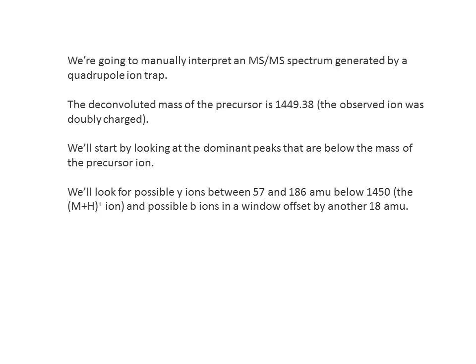This spectrum comes from a quadrupole ion trap. The mass of the precursor was 1449.38 Daltons, and it was doubly charged. We'll start by looking for peaks that are below the mass of this precursor ion. So we're going to look for possible Y ions.